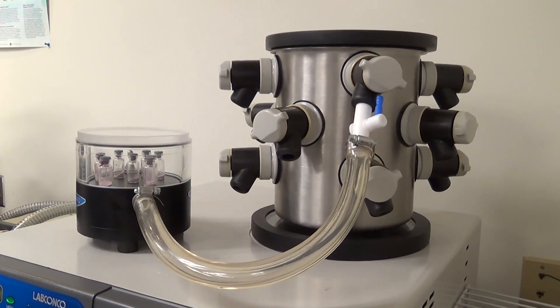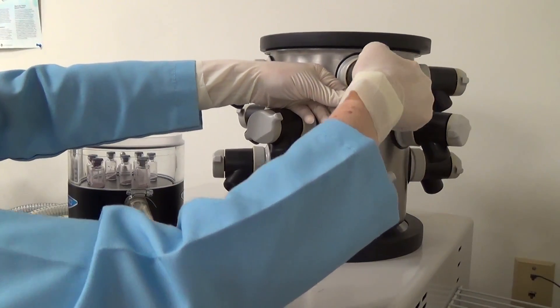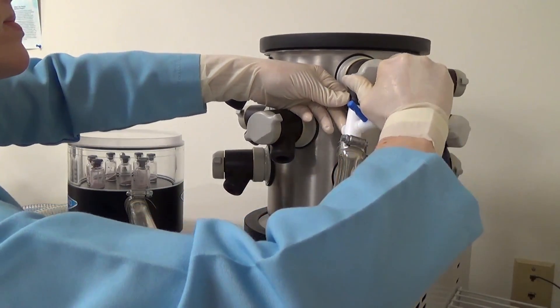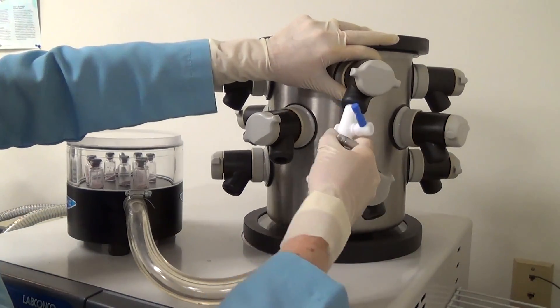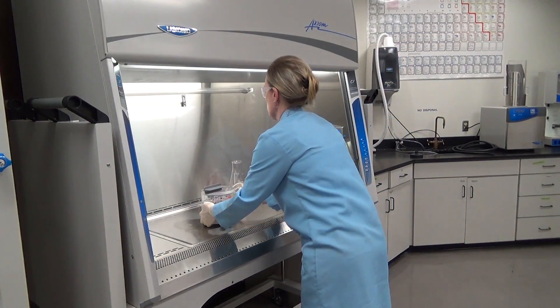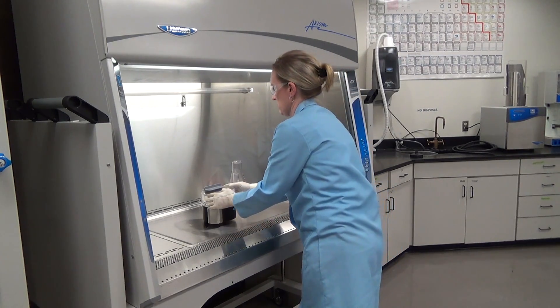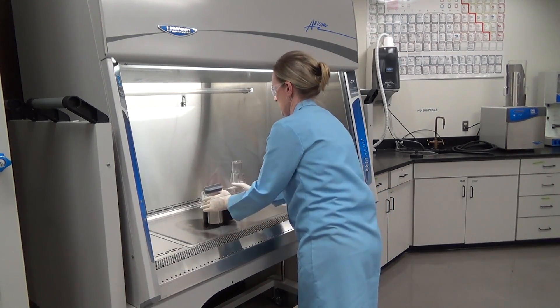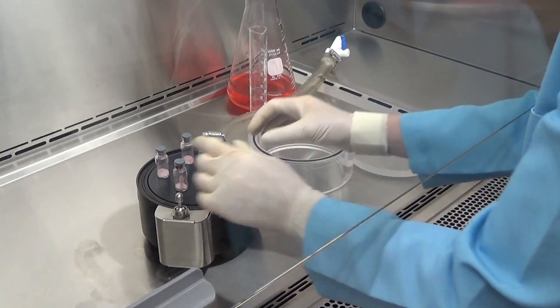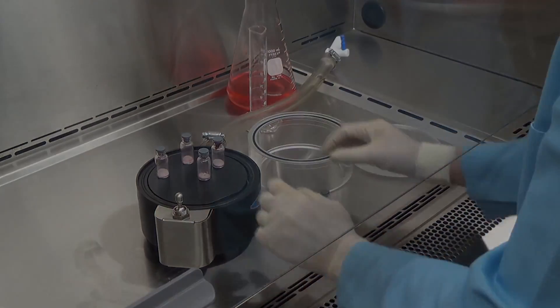Once the sample is finished freeze drying, close the port on the aseptic adapter, open the freeze-dry port valve, and remove the sample. Take the sample to a biosafety cabinet or sterile workspace before removing the sample from its container. If done correctly, your sample has been freeze dried under aseptic conditions.